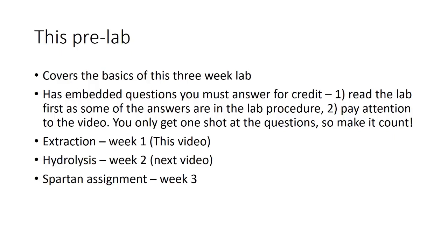Week number 1, as I said before, is the extraction of trimyristin and the purification of that trimyristin from nutmeg. Step number 2 is the hydrolysis of the trimyristin to myristic acid. Myristic acid is formed first by the hydrolysis of the trimyristin to the carboxylate.